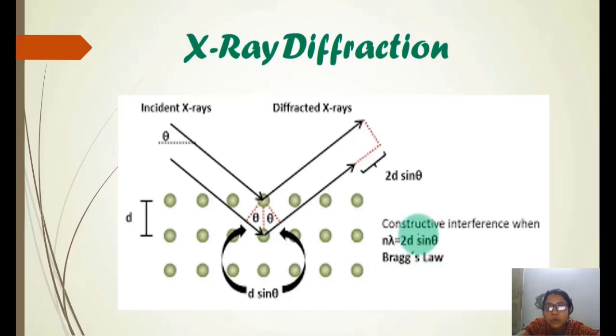Also, this is something interesting here. We are calling it diffraction, but when you talk about Bragg's law, you say Bragg reflection spots. Why do you call it reflection? Because the diffracted spots are basically the reflected spots, and how does it occur?